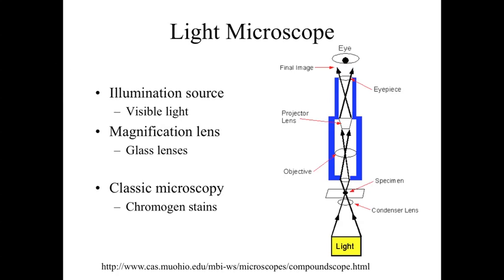The next thing we're going to look at is how the microscope actually works. And so we're going to take a look at the light microscope and then some specialized microscopes that allow us to look at more detail or different aspects of what's going on within a specimen.